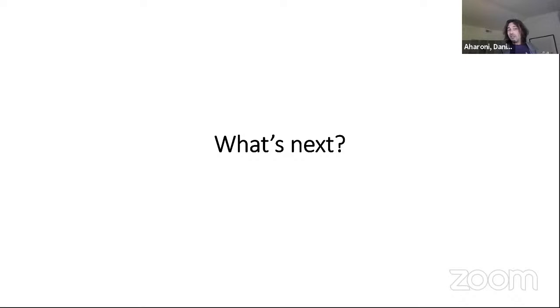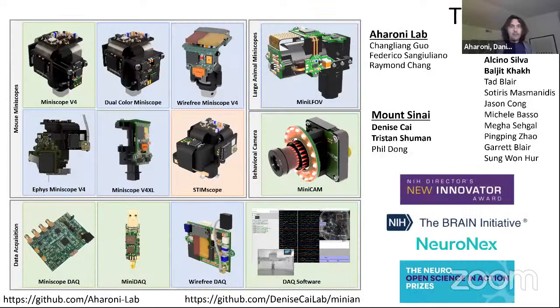And because we can now image long-term without photobleaching, we can record uninterrupted for months as a colony of animals live in a natural environment. And so we're working on building these platforms now with the goal of really being able to do months-long neural and behavioral recording in ethologically relevant environments, and then making all that data and processed data fully accessible to the neuroscience community. So I'll end there, so maybe we have some time for questions.